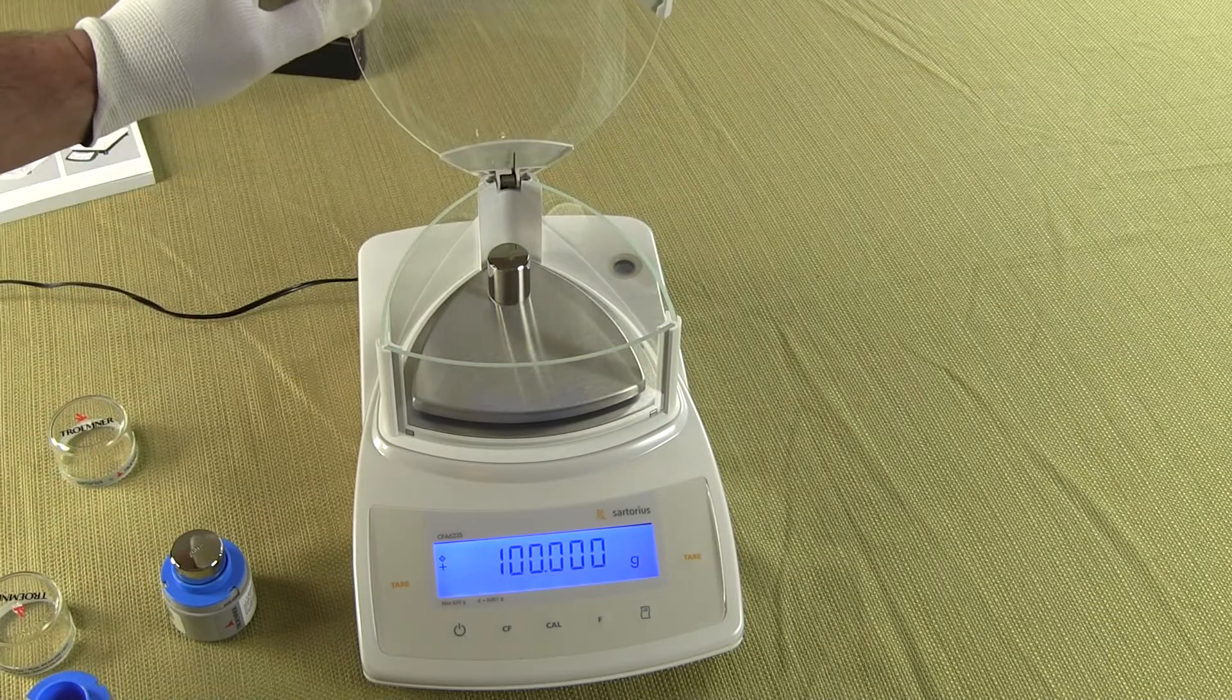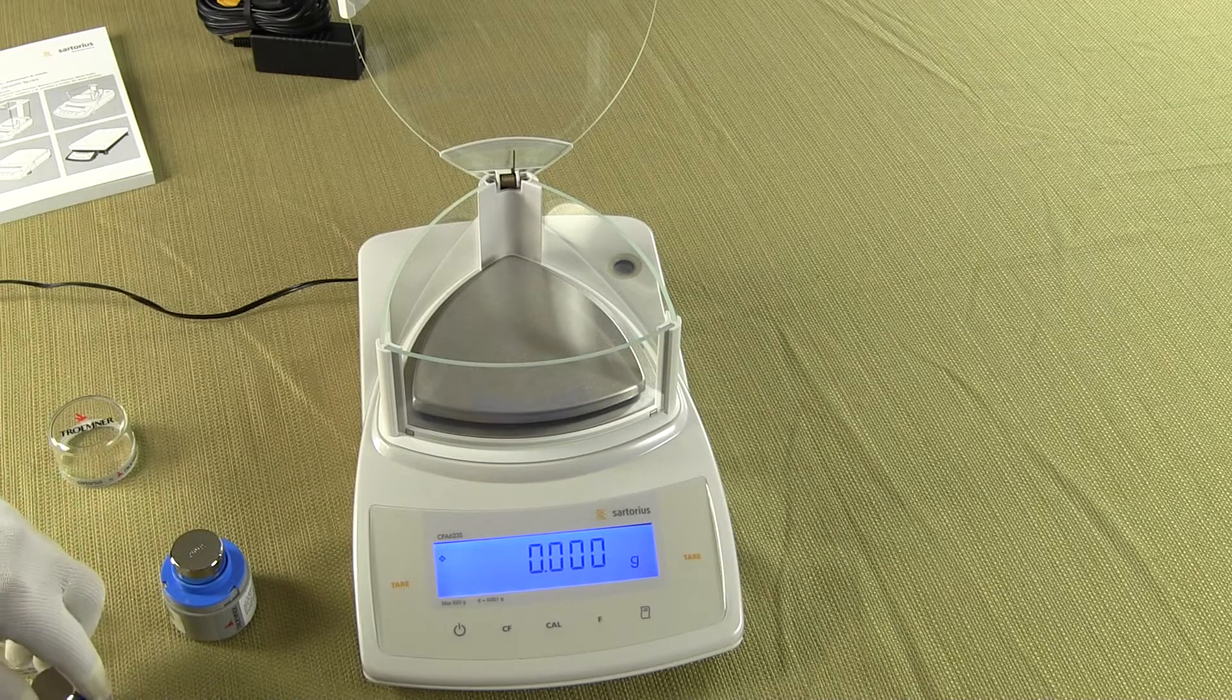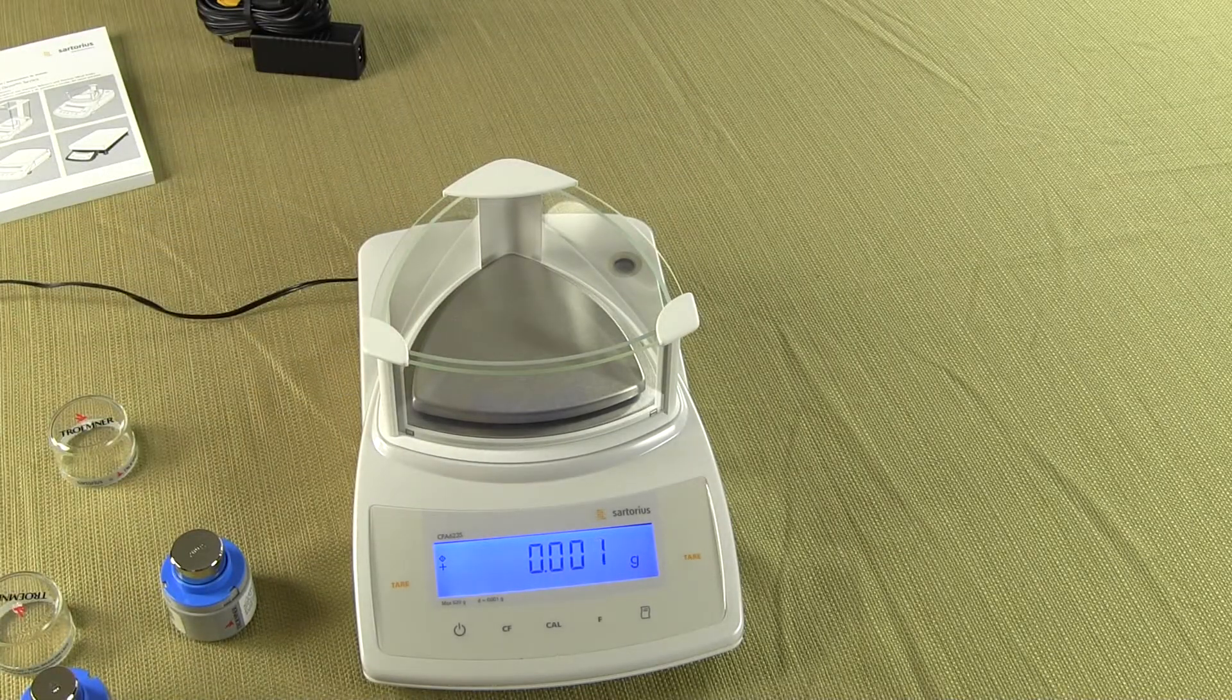So with Sartorius you're buying top of the line and this CPA series has a three-year limited manufacturer's warranty.